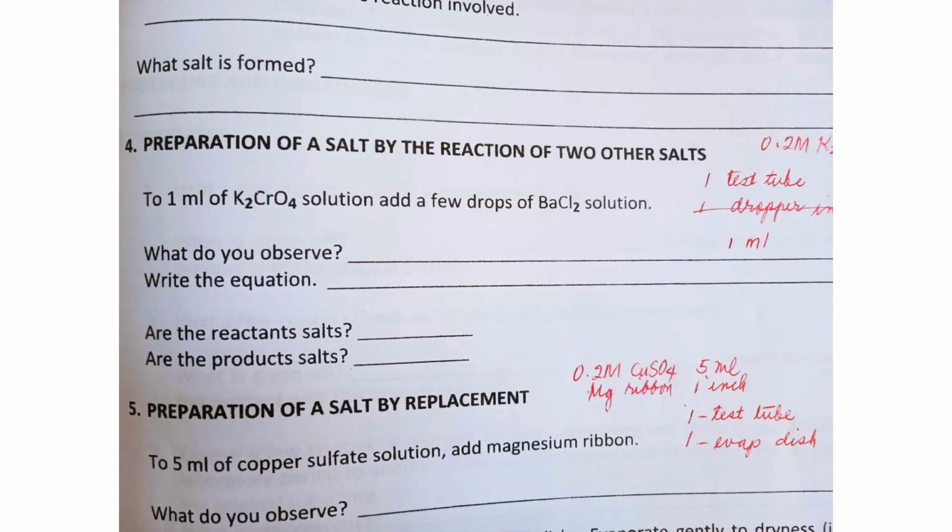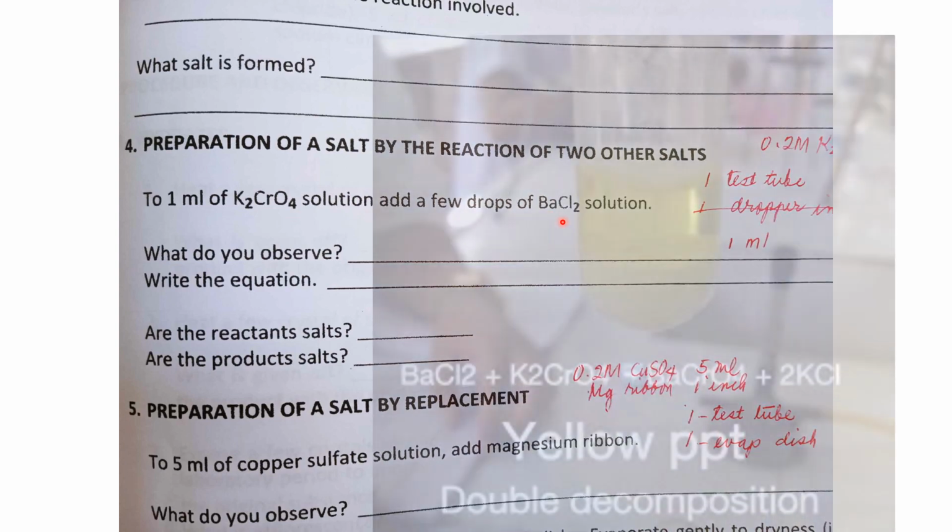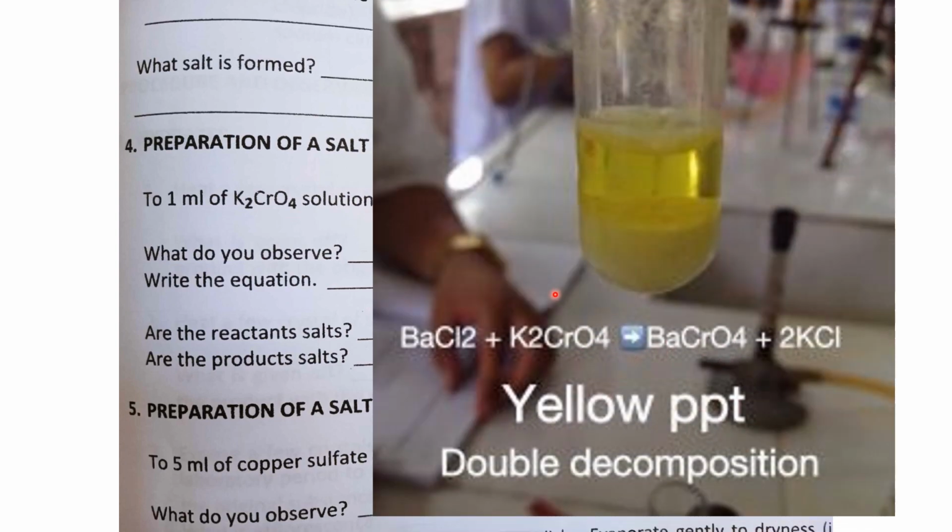Another way to produce salt is by the reaction of two other salts. In this case, the salts involved are potassium chromate and barium chloride. If they are mixed together, they will form a yellow precipitate, barium chromate. And the other salt that is left in solution is potassium chloride. So the barium chromate will be the yellow precipitate.